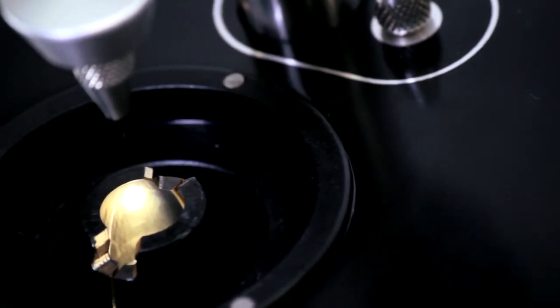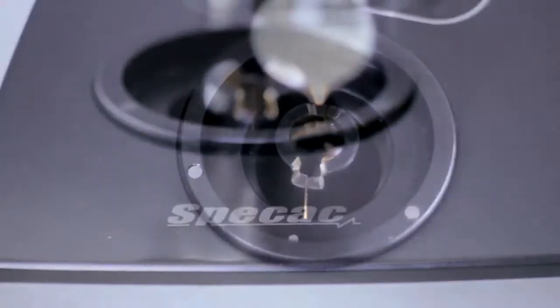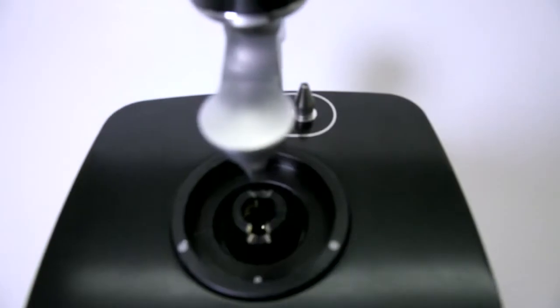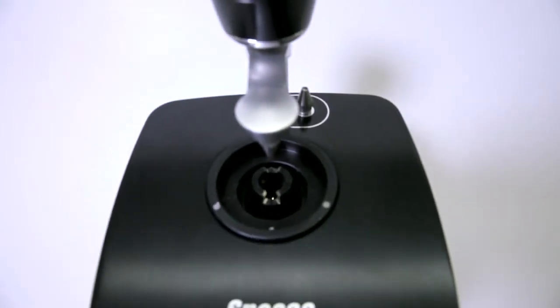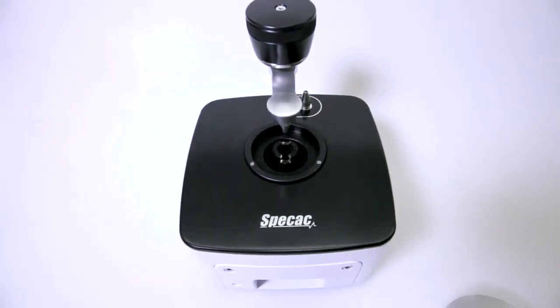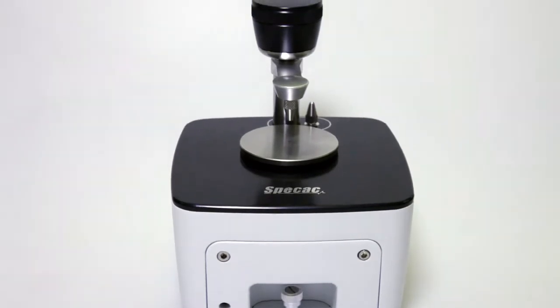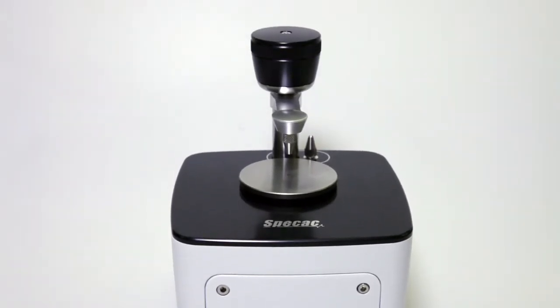The product's innovative optical design is based around all-reflective gold-coated optics and features SPECAC's Synoptifocal Array technology with precision-molded aspheric mirrors. These features allow for a high-throughput accessory with an extended wavelength range capability to match the range of your mid or far IR FTIR instrument from an appropriate choice of ATR crystal.